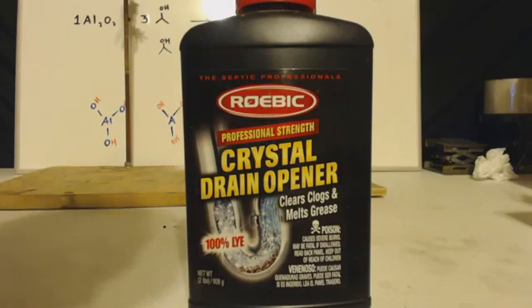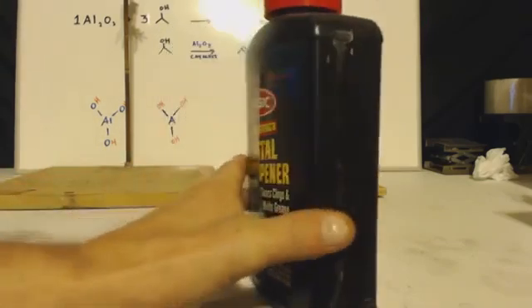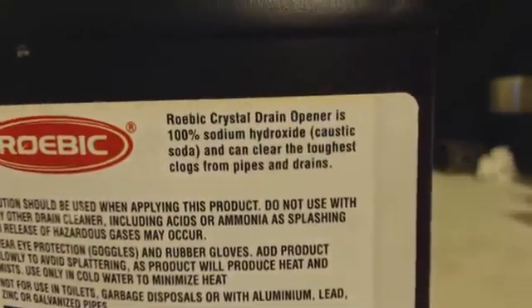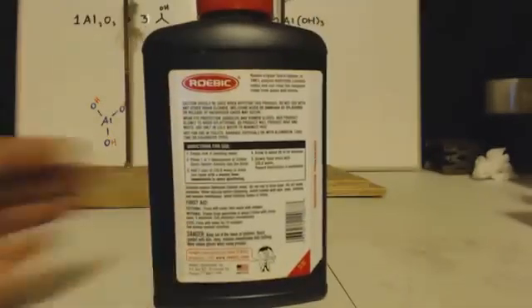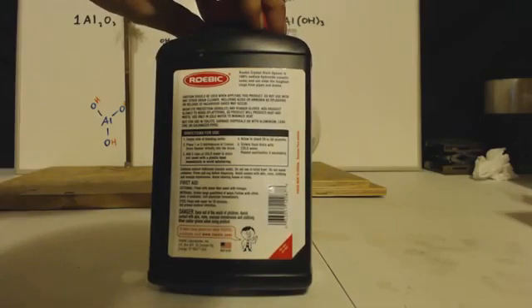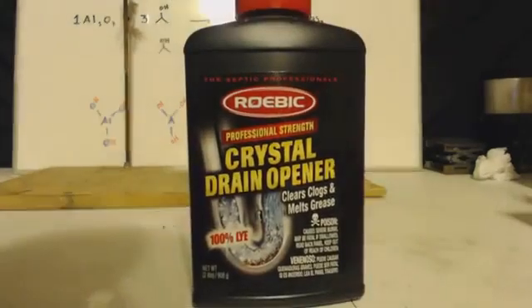This is John Black, super chemist. This is a nice simple video just telling you how to get something — it's sodium hydroxide. I basically get this stuff here from Lowe's, probably get it from any hardware store. It's a hundred percent lye; I don't even re-crystallize it, that's how pure it is. Even on the back, if you look here, as you can see, it says a hundred percent sodium hydroxide, caustic soda.